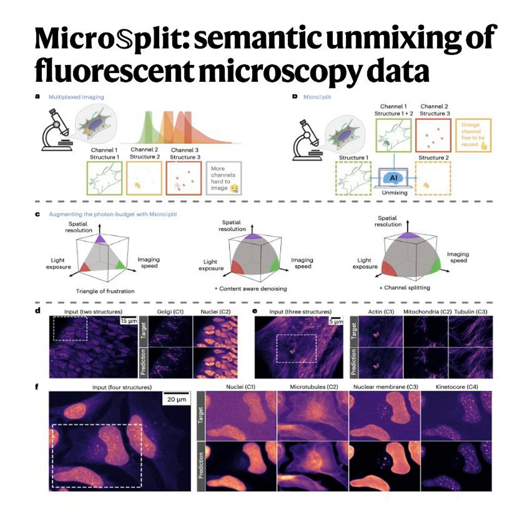And in practice, what does that look like for the researcher? It outputs a literal heat map overlaying your data. Where the heat map glows bright, the AI is explicitly telling you, hey, I am highly uncertain about the unmixing in these specific pixels. Which is incredible because it allows you to confidently flag, manually review, or just completely discard unreliable data. You aren't just blindly trusting a black box.